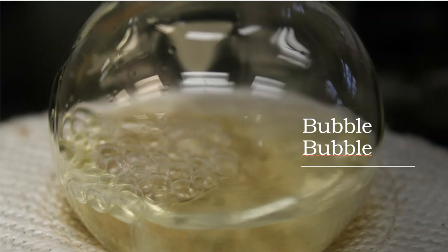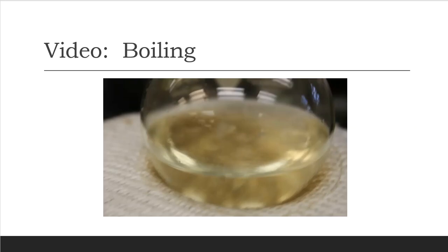All right, so here I finally get some bubble, toil and trouble into my boiling flask that's down below, which is a good sign. That means everything was heated up, and it also means that I'm getting ready to get some impurities off. What is that impurity, you say? Well, what was the solvent that we used in the borohydride reaction? Wasn't that THF?